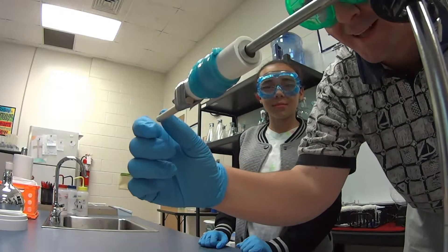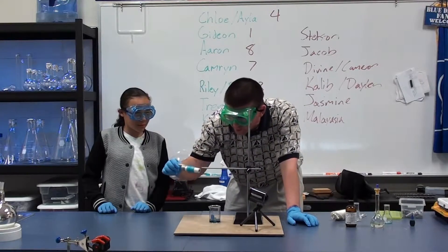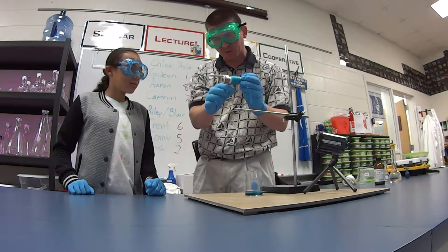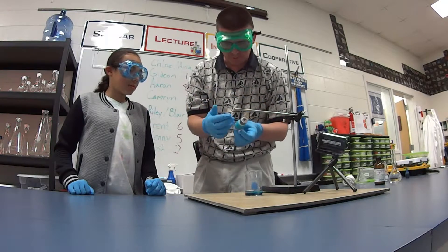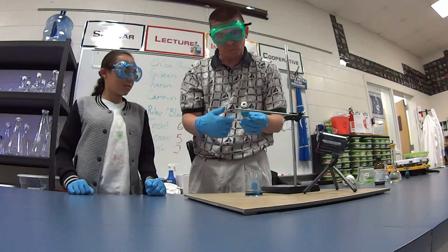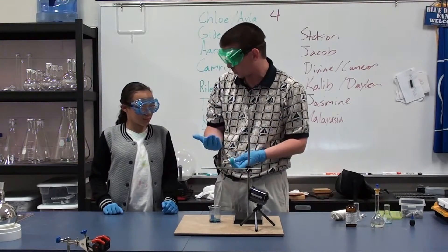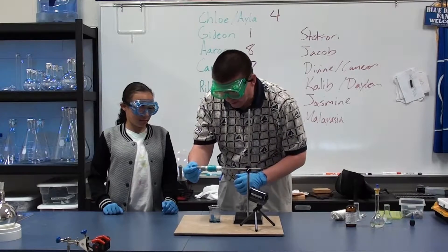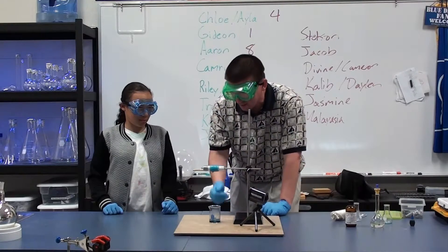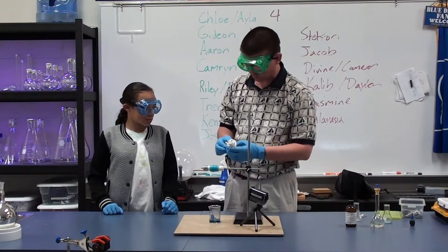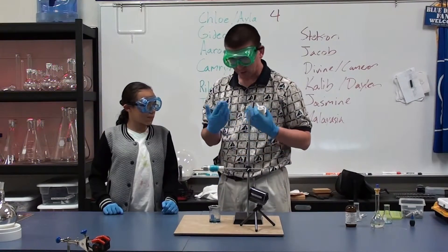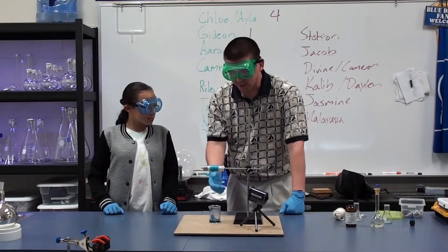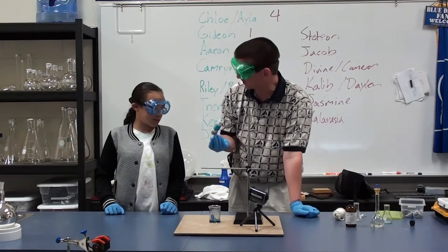You broke it! But there's still more chemicals in there, and we could make some more if we wanted to. On our spool we've got a spool of nylon thread — it's thick thread, but it's basically nylon thread that we've made. It's blue because of the food coloring, and we could make it any other color. Just like with your nylon jacket or book bag, they dye that nylon material to make different colors. Here's some nylon rope where little pieces of nylon have been woven together. They use it for tents, jackets, and all sorts of different materials and things — all from this simple chemical reaction. Pretty neat stuff!